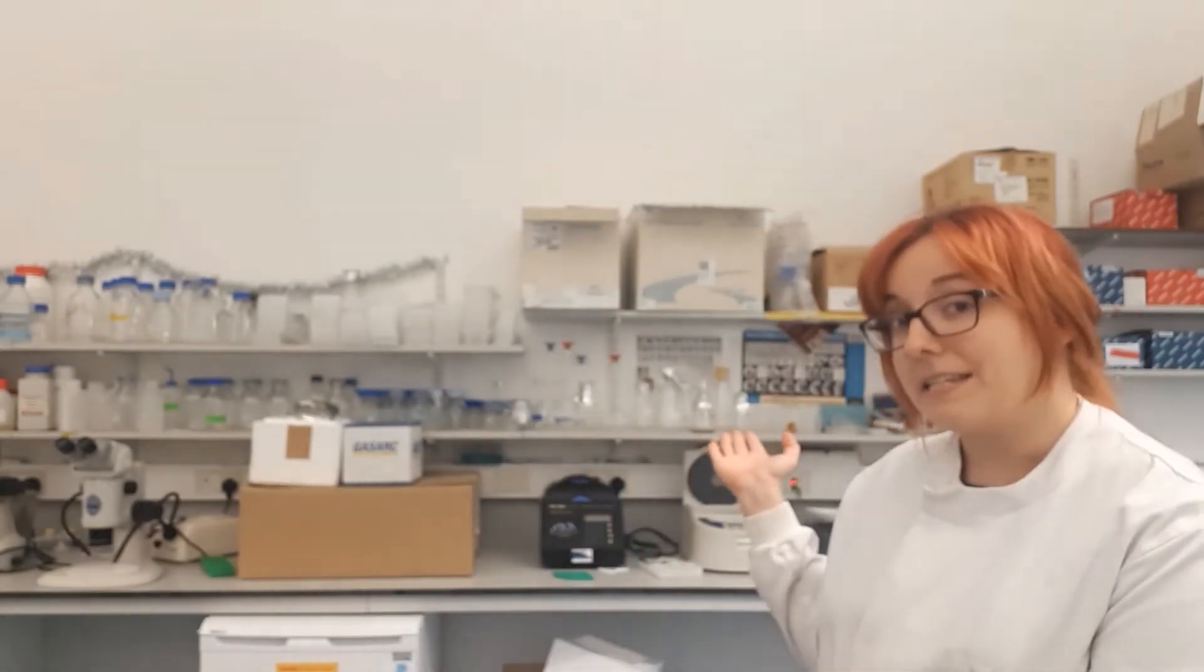So if you look behind me, you can see I'm in a laboratory. I'm wearing a lab coat, so I'm a scientist. I'm a scientist at the University of Aberdeen and my favorite piece of equipment is called a microscope.